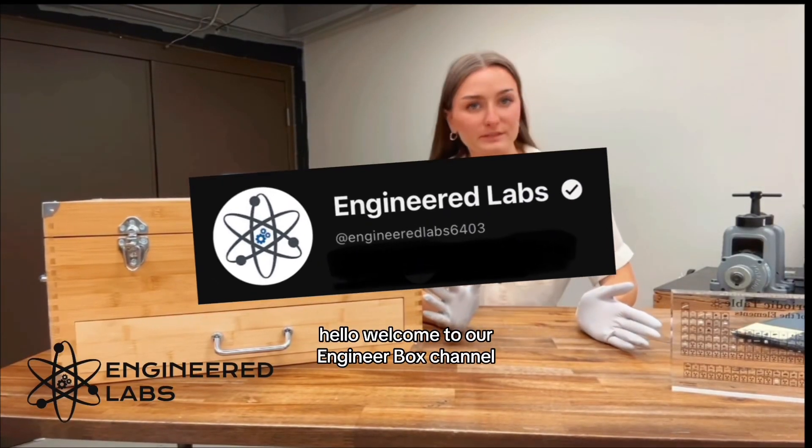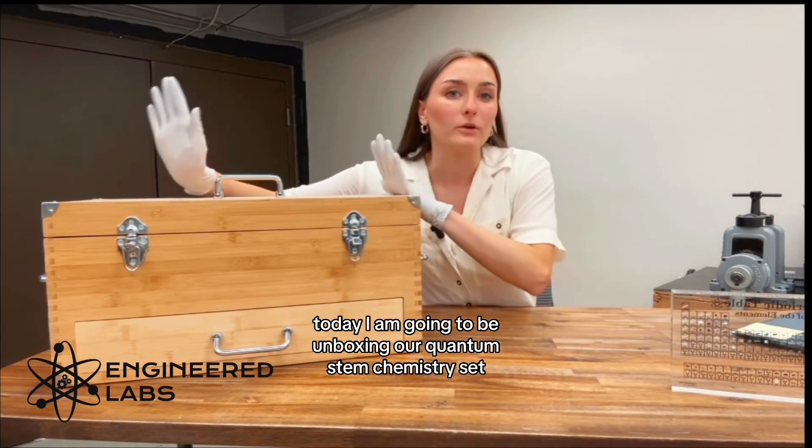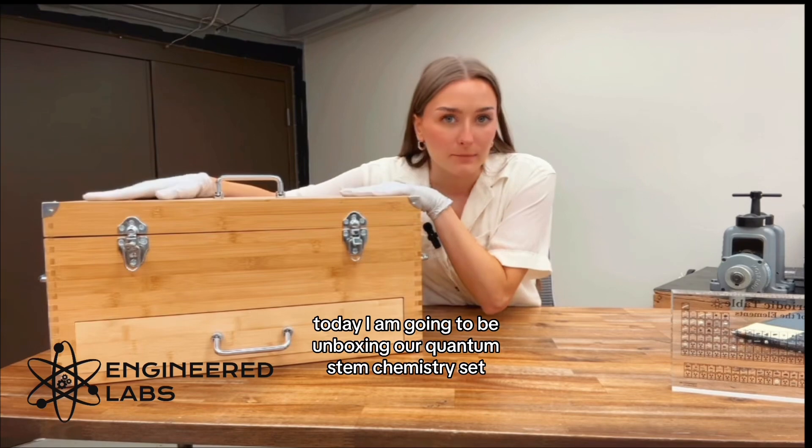Hello, welcome to our Engineered Lives channel. Today I am going to be unboxing our Quantum STEM chemistry set.